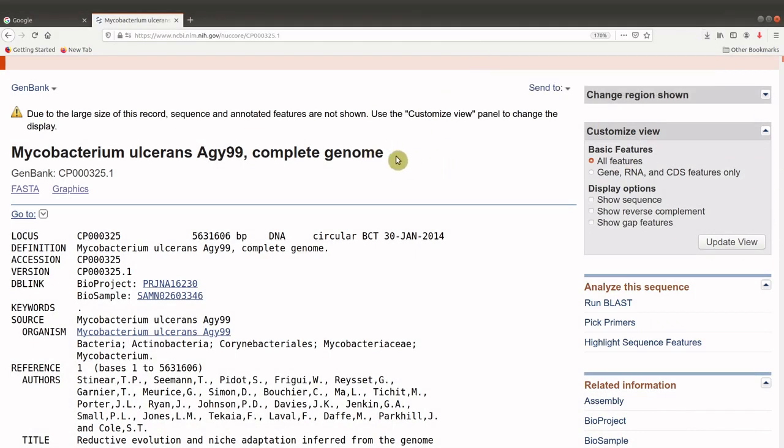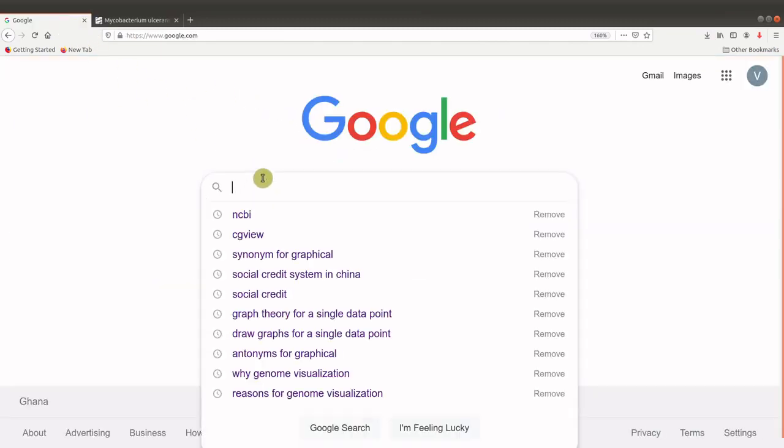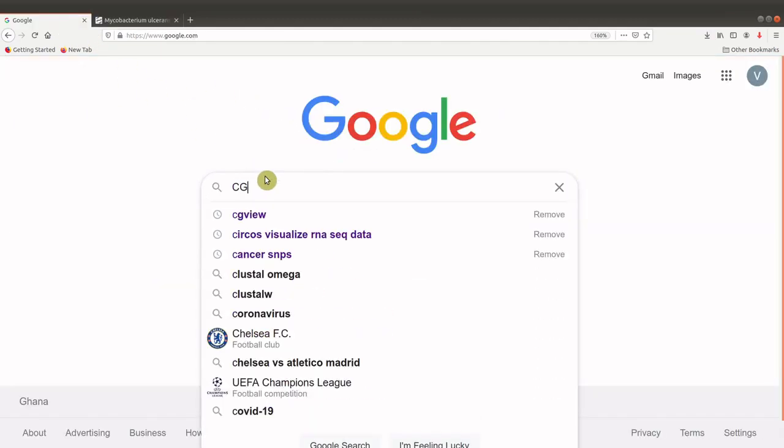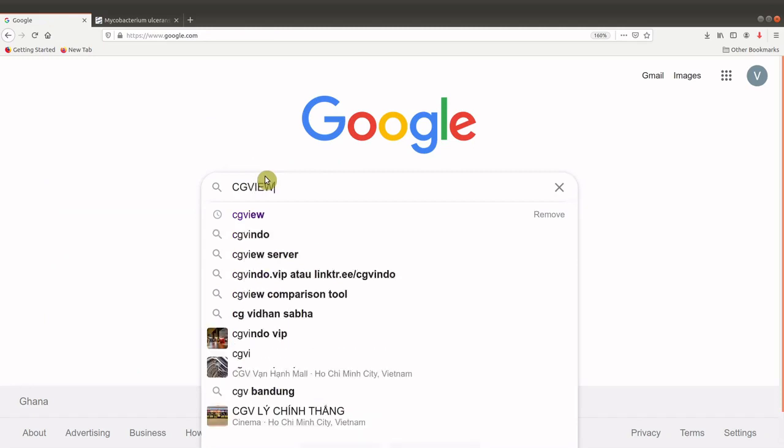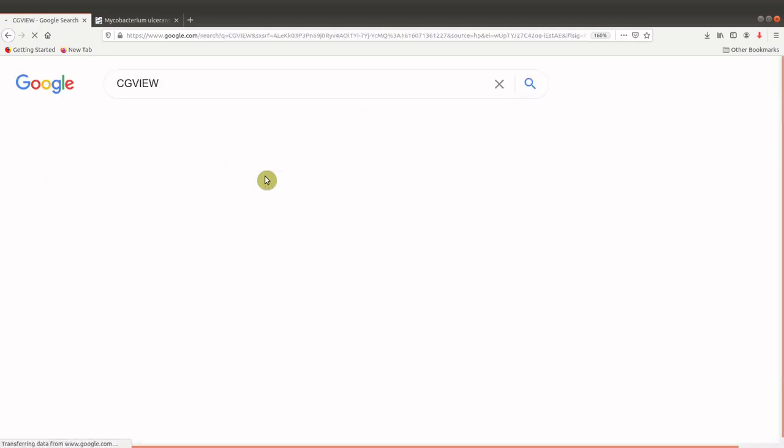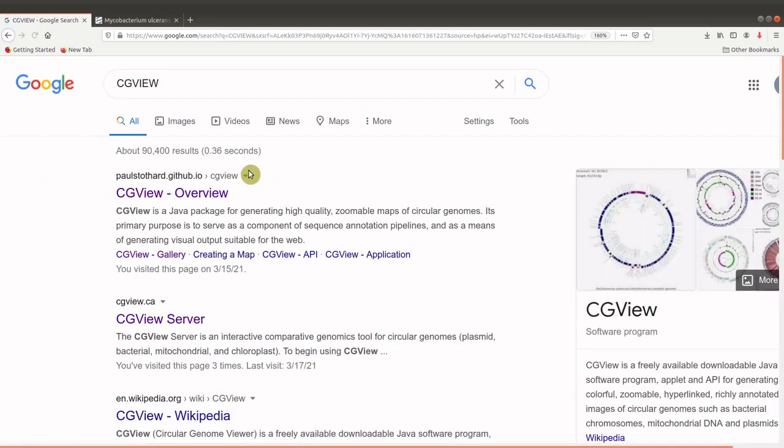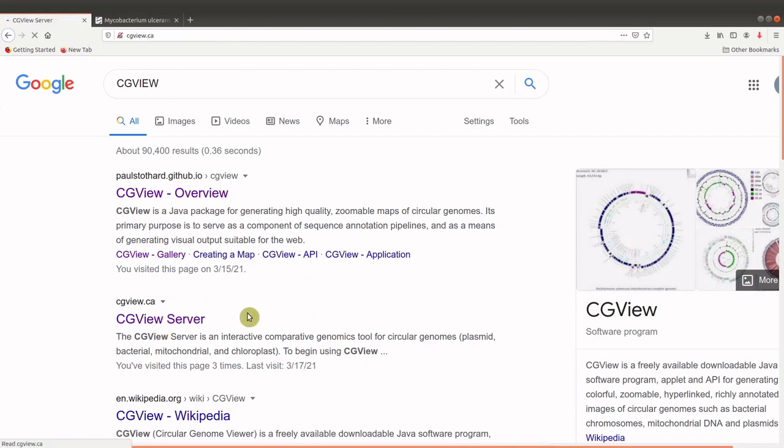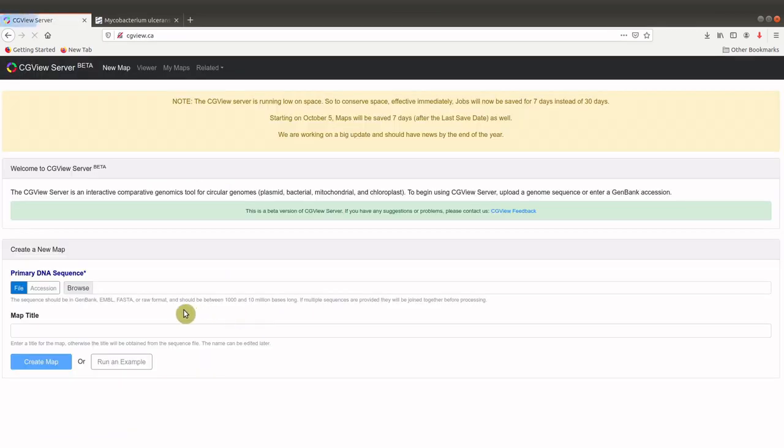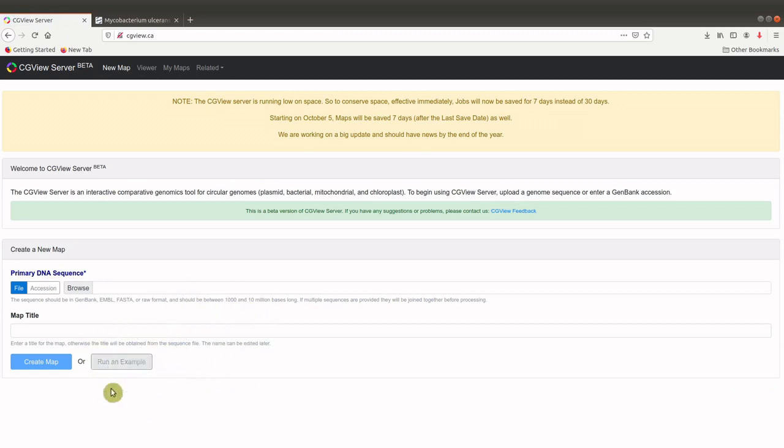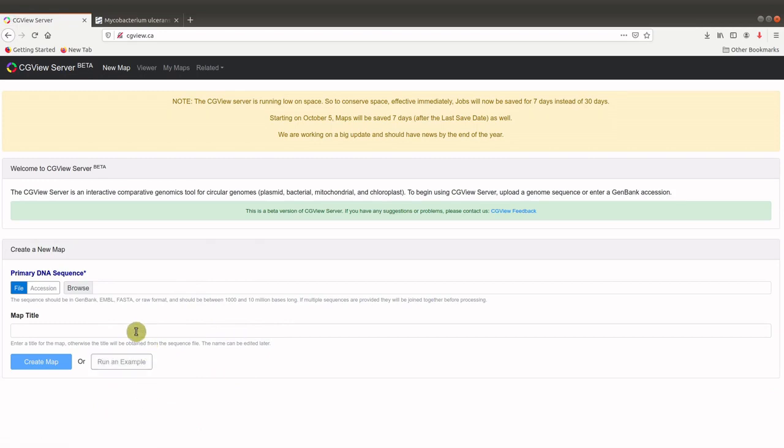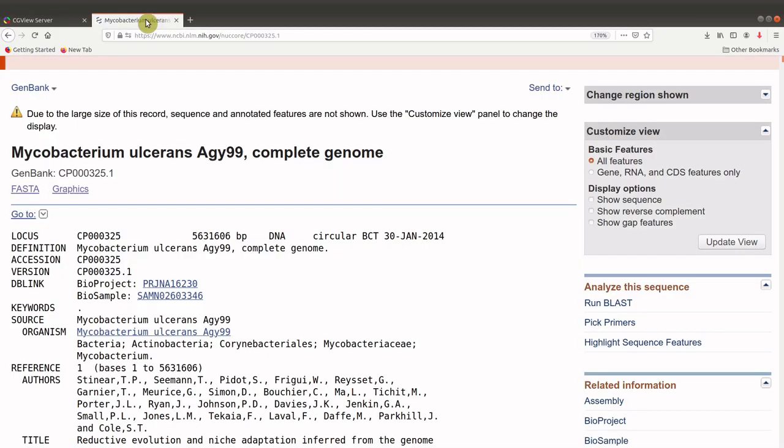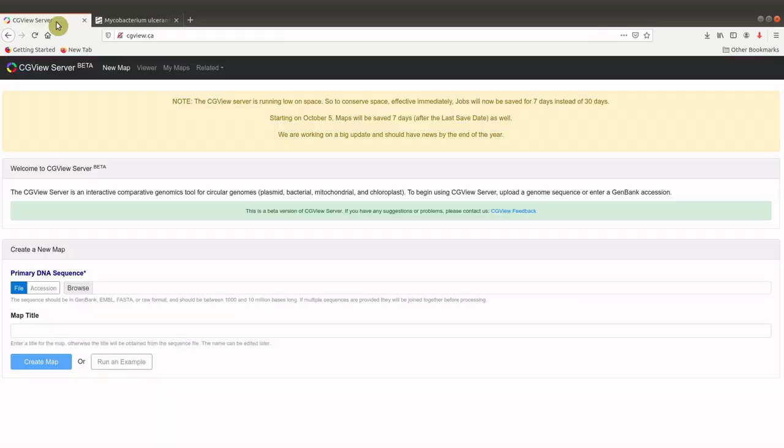After getting our data, we will go to the CGView server, the web server. So let's search for CGView. So we use this link. Now, on the CGView web server, you can run an example using their inbuilt data sets, or you can use your own data sets. We have downloaded our data sets from NCBI. So we use that.